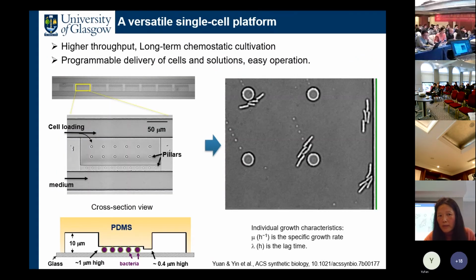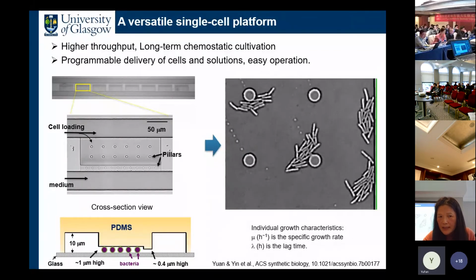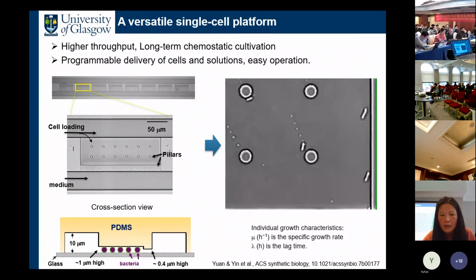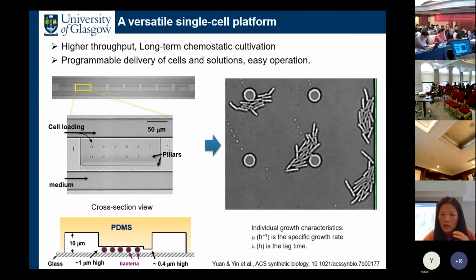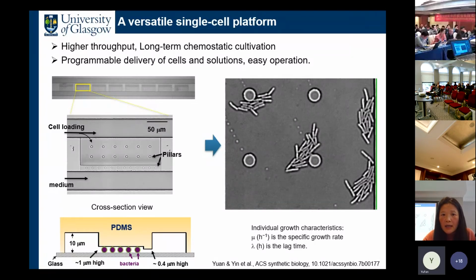And very soon, we developed a series of single cell microfluidics. And this is one example. The example I show you here has many chambers. We use the middle chamber to trap cells into a monolayer, and we use the side channel to deliver different reagents, different cells. That will allow us to control the microenvironment in a flexible way.